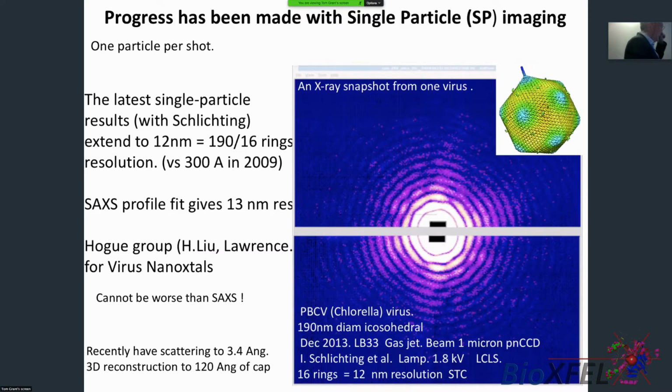But Mike Dunn, in his wisdom, set aside special beam times which are unrefereed and where people from anywhere in the world can come over the last year and try to improve matters. That's called the Single Particle Initiative, and it's been dramatically successful in cleaning up the beamline, getting rid of background, and giving us high resolution data.